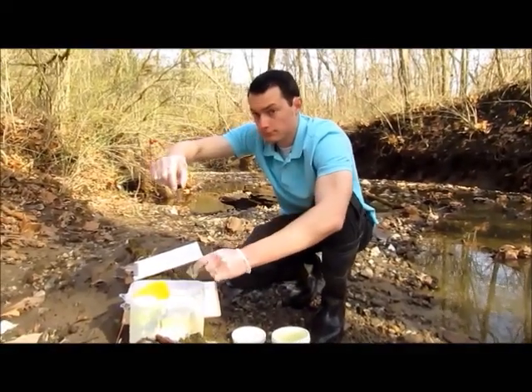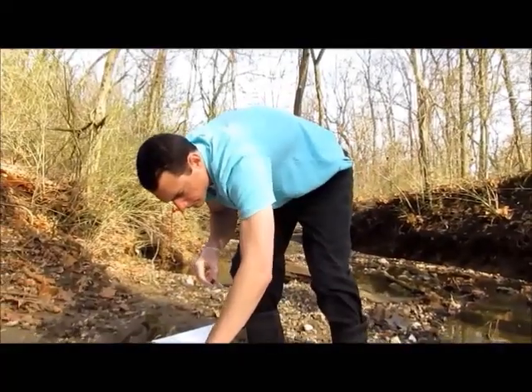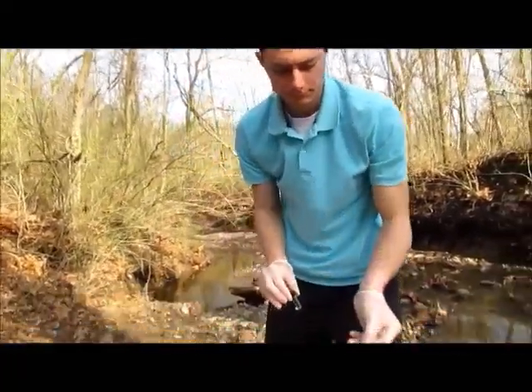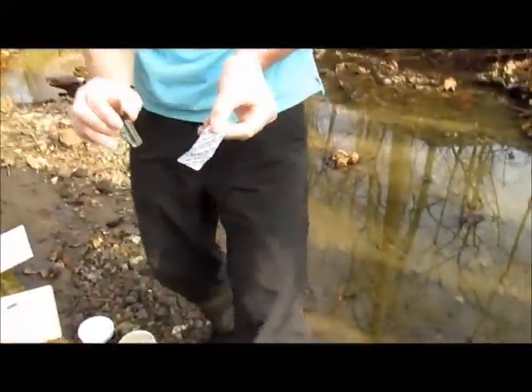Next, you will need to find your dissolved oxygen test tablets. These look like a little tablet pack that says DO on it, for dissolved oxygen.